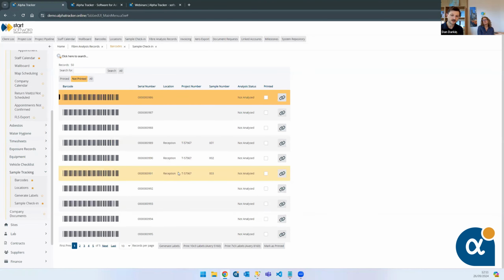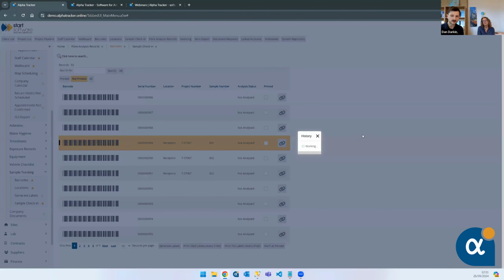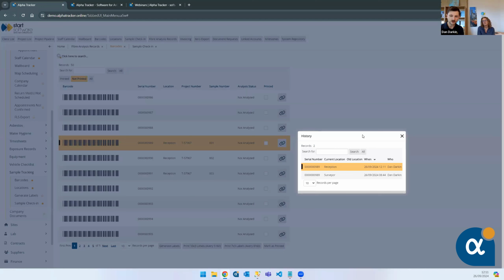So that's updated those. And then if we go to our chain of custody, you'll see we've now got a new record, reception. I was the one that checked it in, and we did it at 11 minutes past 12. So you could be using this screen, couldn't you, to be saying, well, where are my samples? Exactly. Look for this job number, see where they all are. I'll see the history of their locations as well. Exactly. And then you can see, oh, okay, they're in the in tray in reception, or the surveyor hasn't been back to the office yet to bring them in. They've probably still got them in the van or something like that. So you can see exactly where things are at any given stage. It's really, really useful.